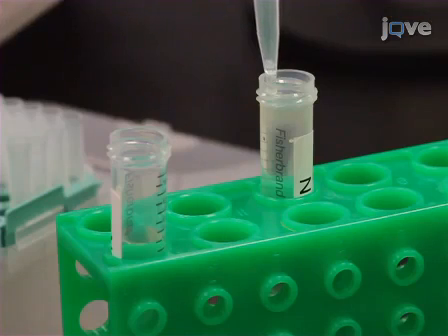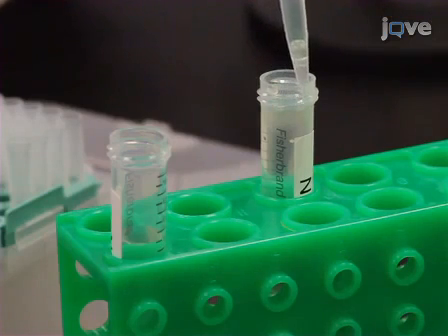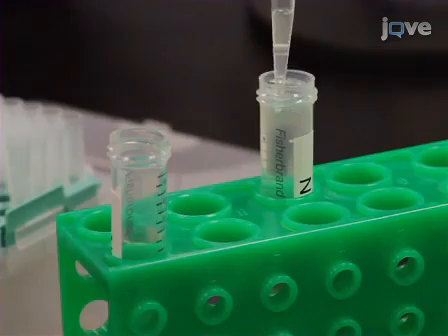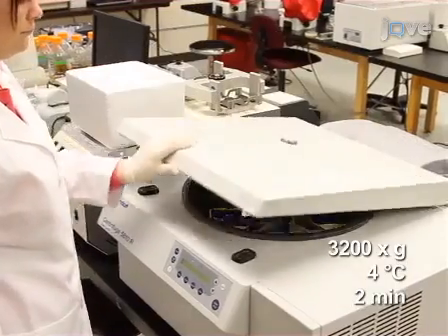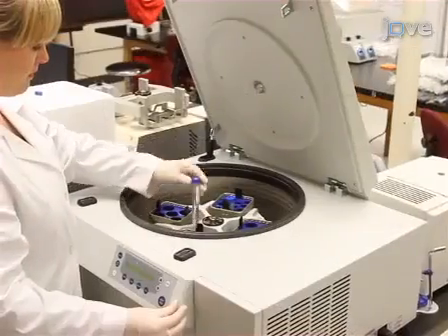Now, bacteria-free worms will swim up, are collected, washed in RNase-free water, and pelleted again.